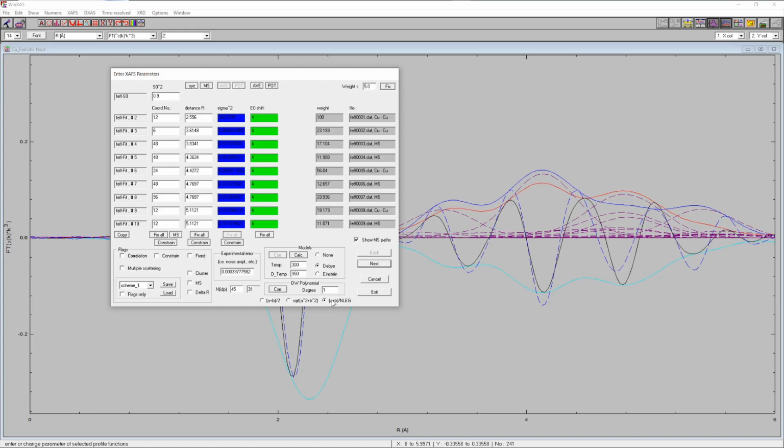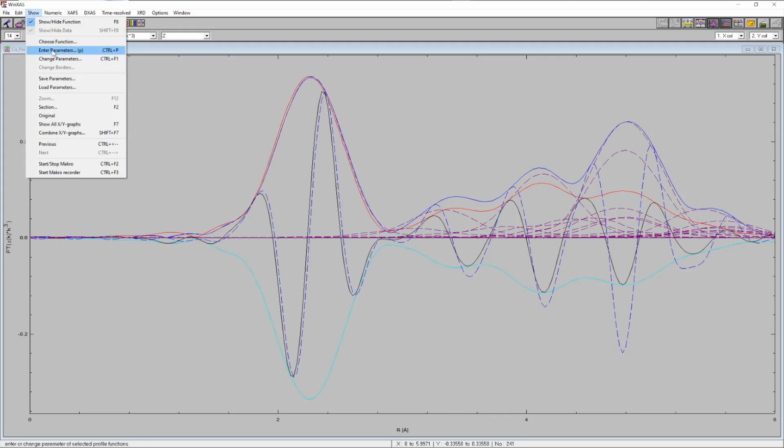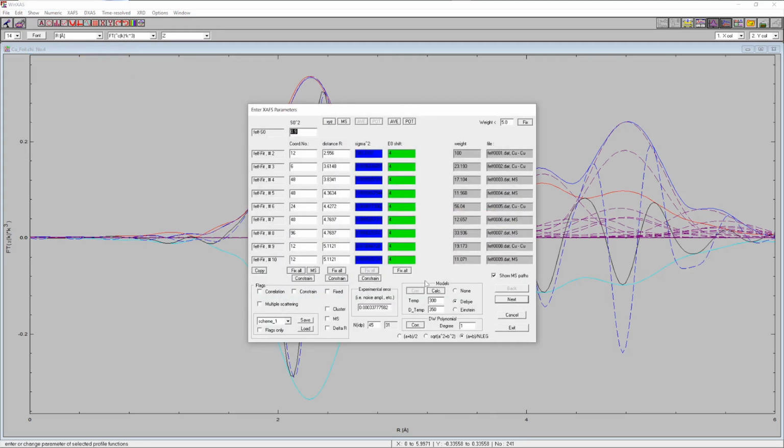And there is another option here that we can try and calculate. But on the other hand, this results in an increased amplitude, basically, of the multiple scattering path compared to the single scattering path, and also does not improve the agreement between experiment and theory in this range. So this does not seem to help. So basically, I just wanted to show the available options.